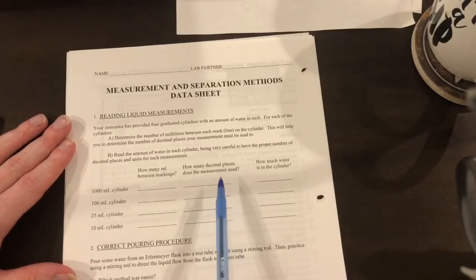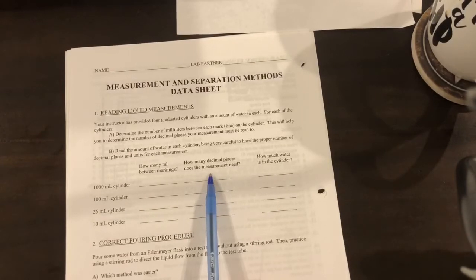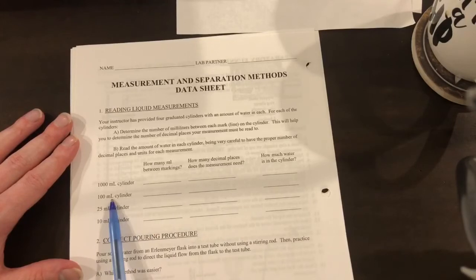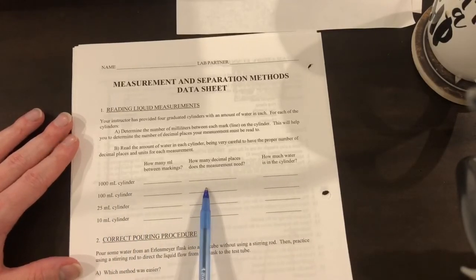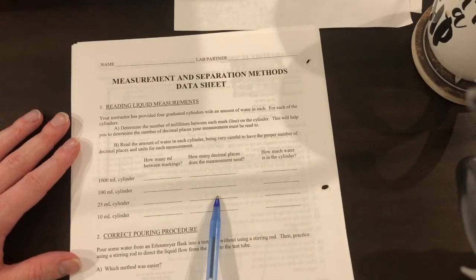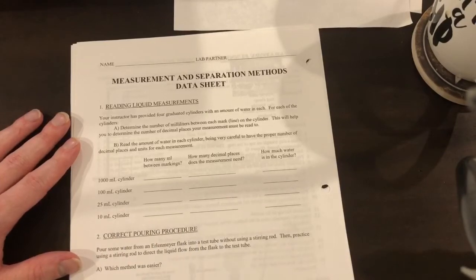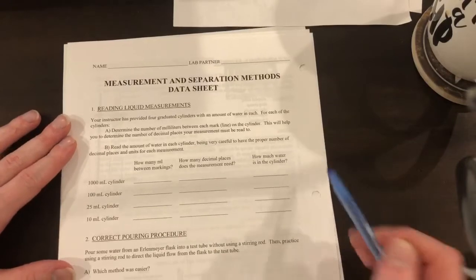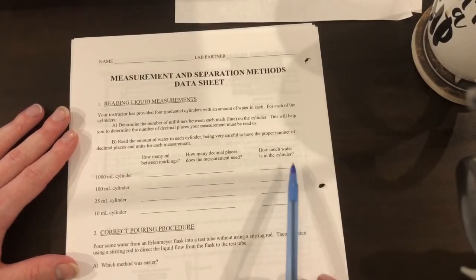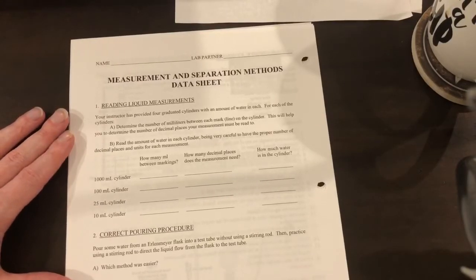For decimal places: the 1,000 mL cylinder needs zero decimal places since you can't measure to the decimal with certainty on the big cylinder. The 100 mL and 25 mL cylinders can measure to one decimal place, such as 0.5. The 10 mL cylinder can go to two decimal places. The important part is recording how much water is in the cylinder, written to the nearest decimal place.